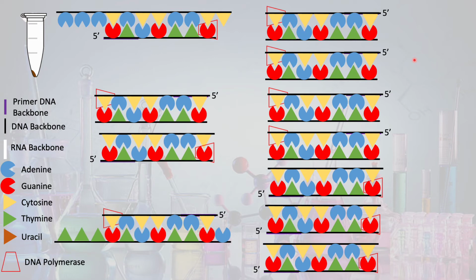and now the next step is to see if we've generated A, the correct DNA, and then B, see how the different types of treatments have affected essentially the ratio of DNA that's produced, right? So remember, the ratio of DNA produced is completely reflective of how many mRNA transcripts there were in the original sample.